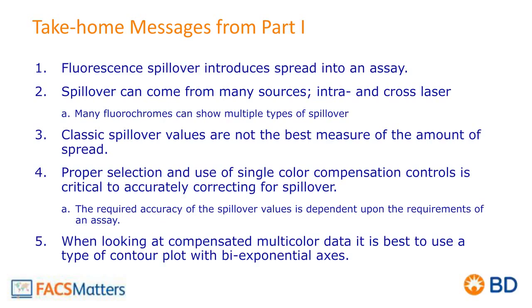The proper selection and use of compensation controls is critical to accurately correcting for spillover. And we talked about the fact that the amount of accuracy that you need is in fact dependent upon the requirements of your assay. And last, when looking at compensated multicolor data, it really is best to use contour plots with biexponential axes.